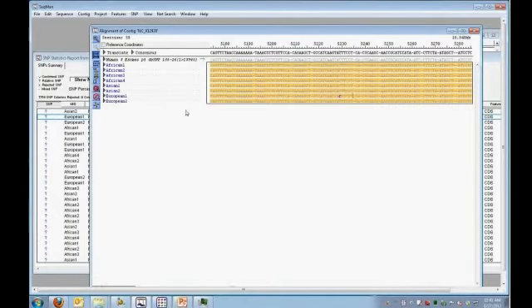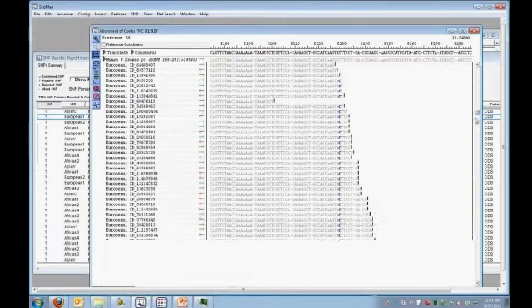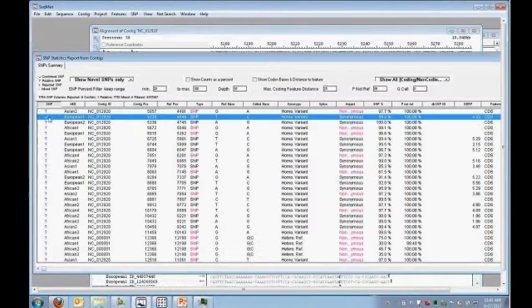And I can see one of my samples, one of my European exomes, has a T to C SNP. And I might verify and look at the alignment here to see, do I think that's a real SNP or not? In this case, I'm going to say that looks like a real SNP. And so when I check it, that makes an annotation there.